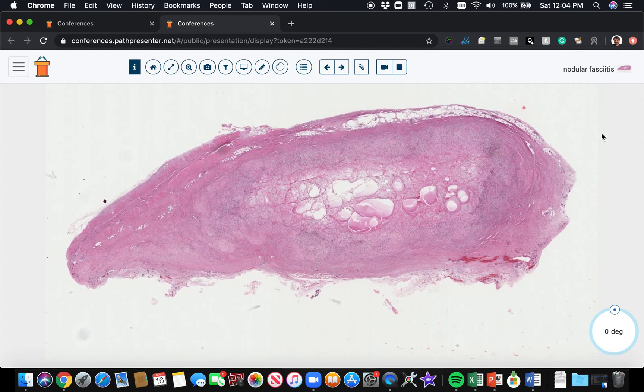This is an example — ignore the label here. It says nodular fasciitis, but actually we're dealing with a special variation of nodular fasciitis.